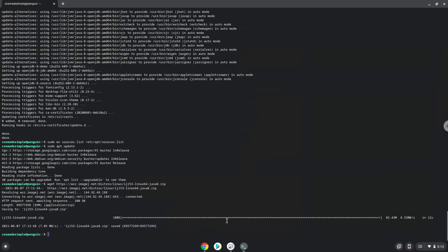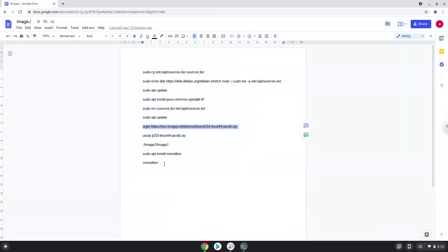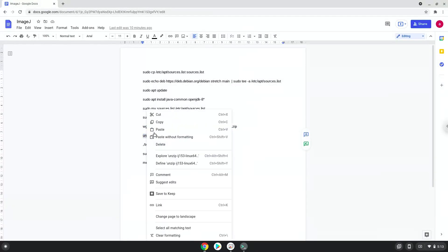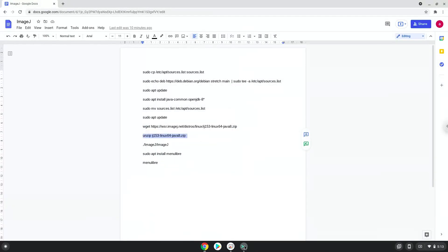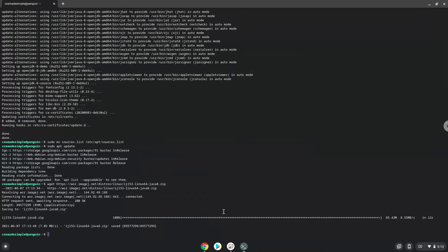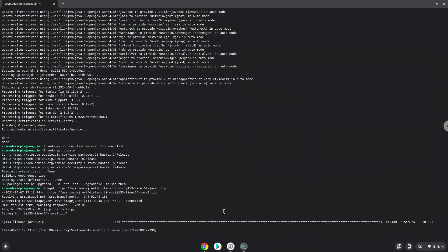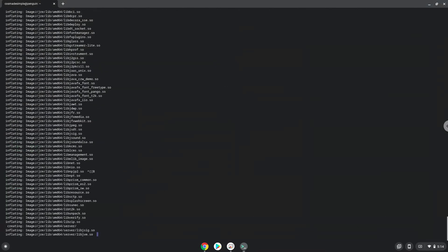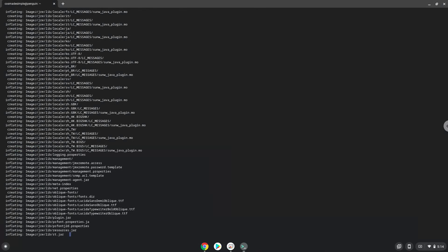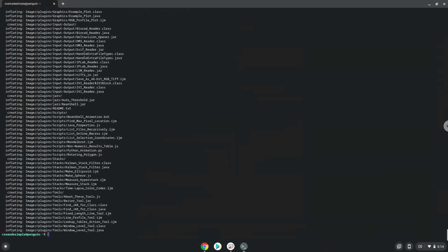Now we will extract the package. Now we will launch image from the terminal to make sure that it works.